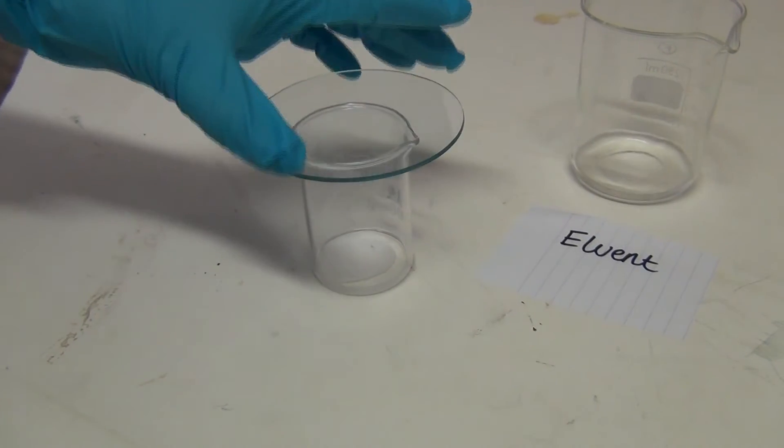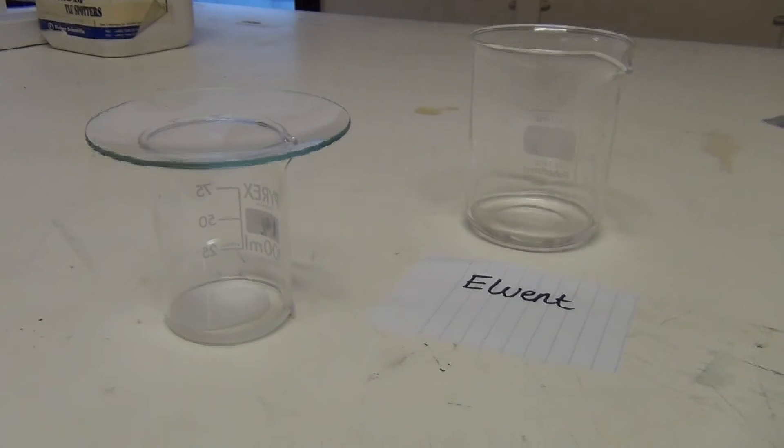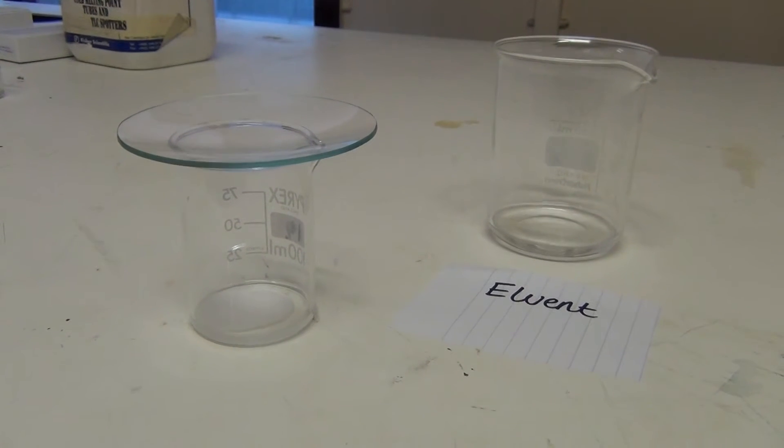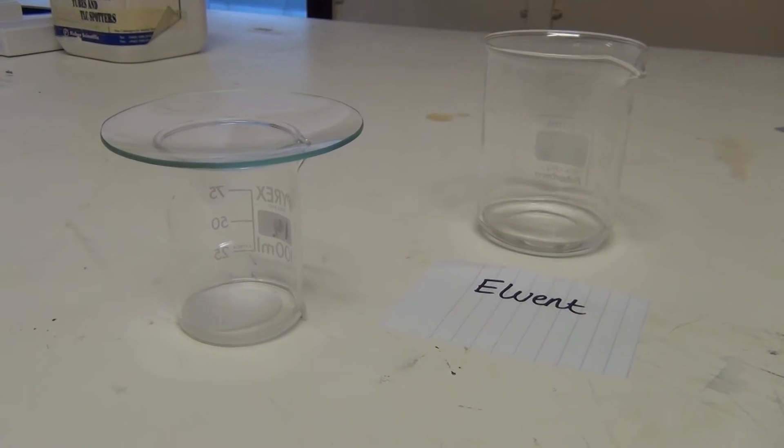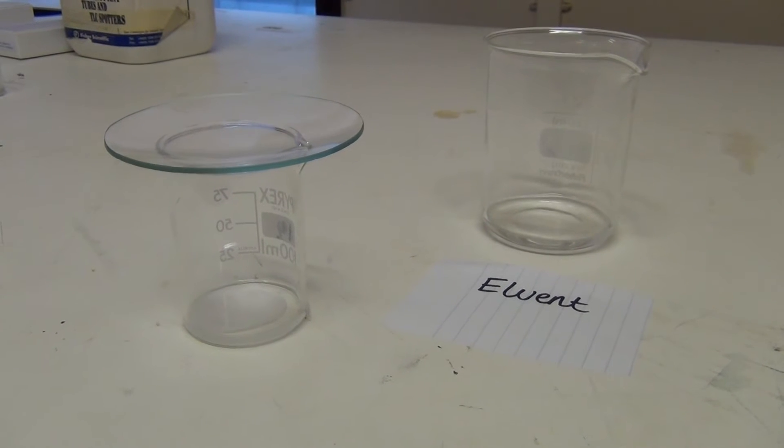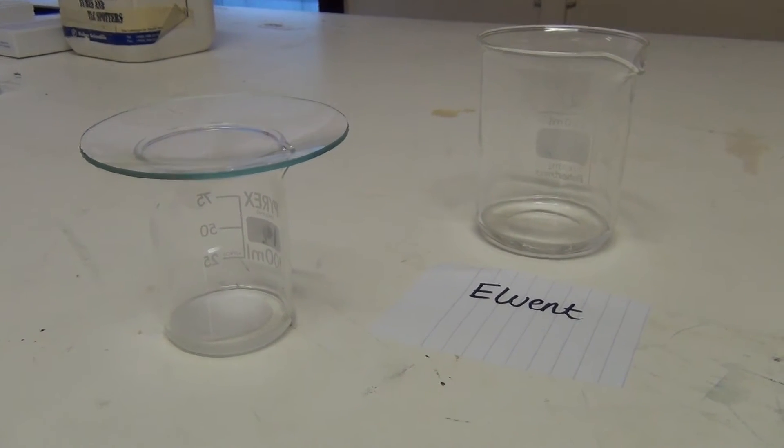This solvent is known as the eluent and is the mobile phase in TLC. Then place the lid onto the top of the chamber and leave for a few minutes as this prevents the solvent from evaporating, and ensures that the tank becomes saturated with eluent vapour.